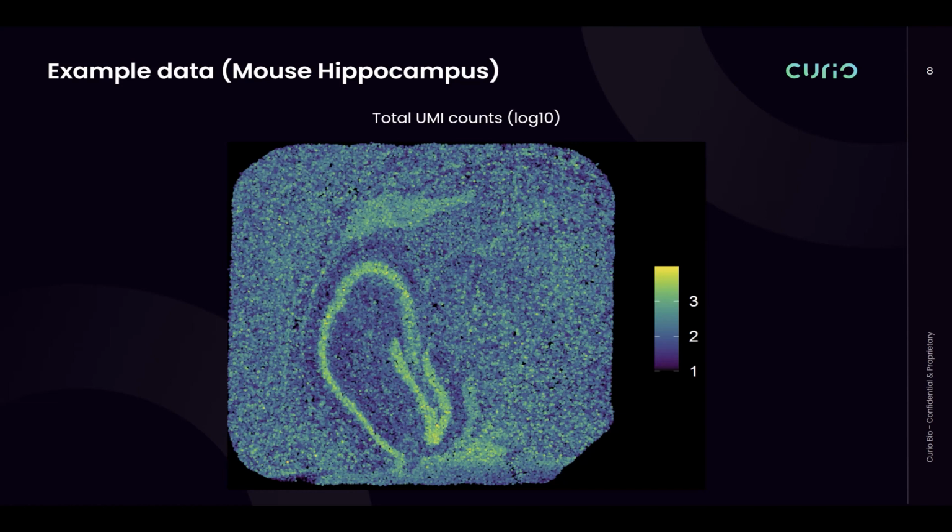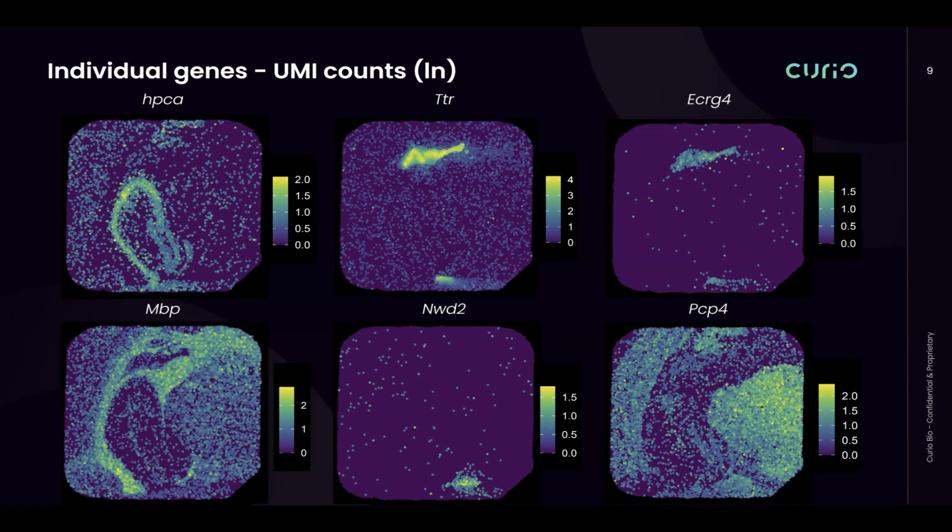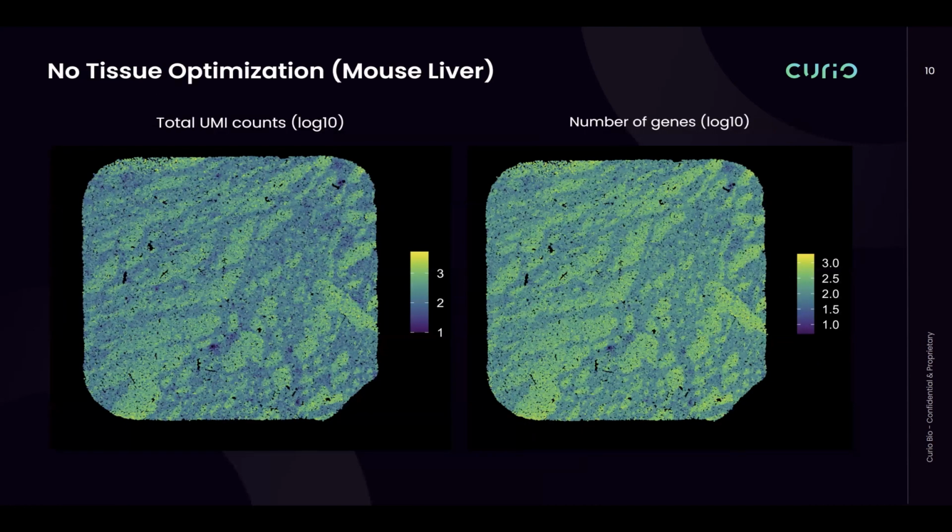And what you can do after this is take it into secondary analysis to look at individual genes where you have really good signal to noise. And because of the high resolution, you can see very clearly the structures of the tissue. As I mentioned before, this is for fresh frozen tissue, and because of that, there really isn't any optimization for different tissues or species. So, this assay is exactly the same protocol for whatever tissue you run or species. So we've had people run this on human, various mouse tissues, chicken heart, planaria, zebrafish, what have you. It all works the same.